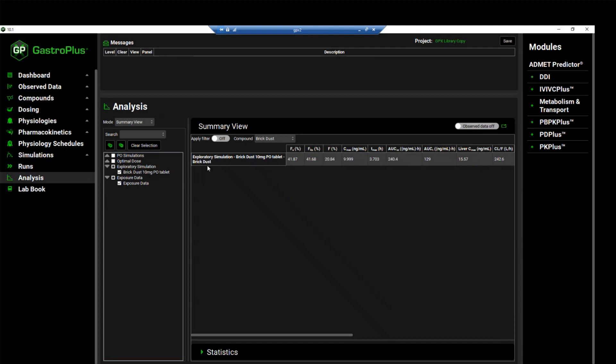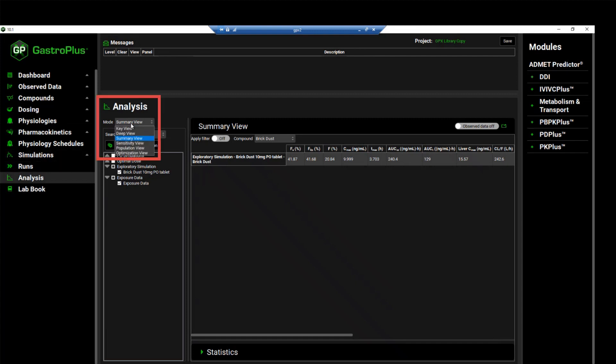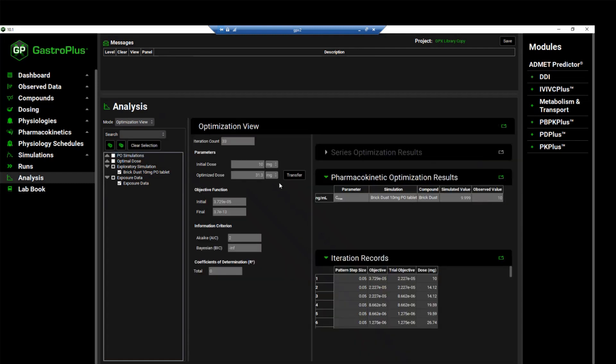In addition to the results that are displayed in the interface, if we come to the optimization view, in addition to these results that are displayed in the interface, an optimization results Excel file is also generated and saved in the same folder that the project is located. You can also use that file to see the updated value for the parameters that you have optimized.